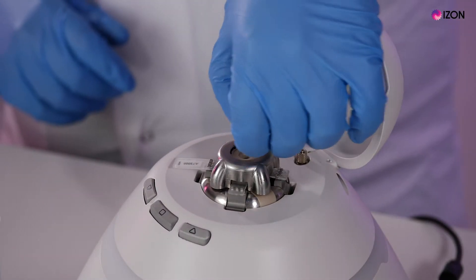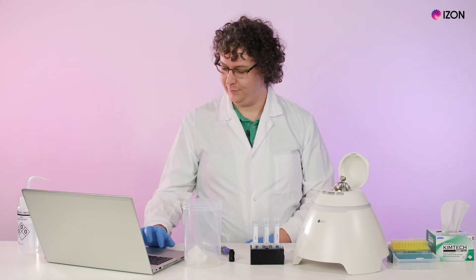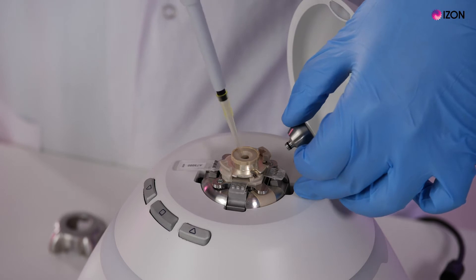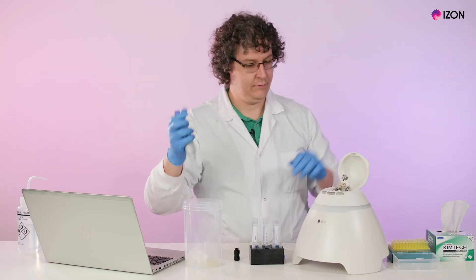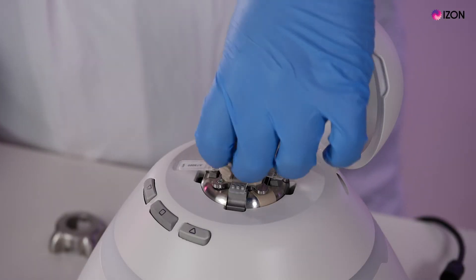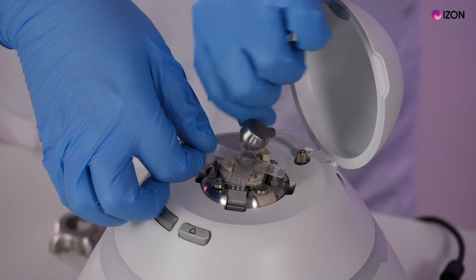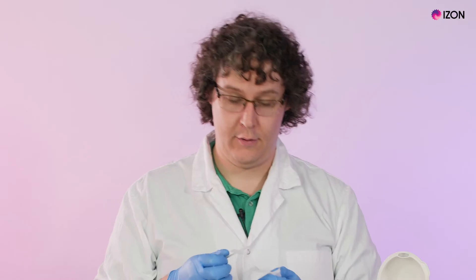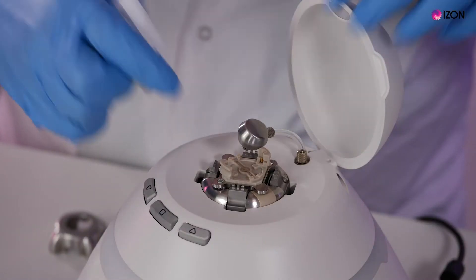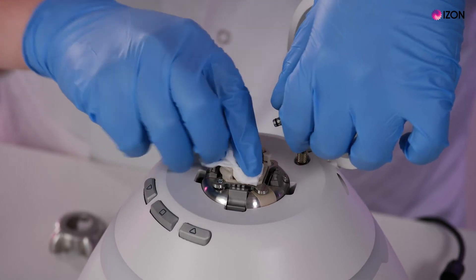Then remove the pressure nozzle and wait for the device to move into the load position. Remove the wetting solution from the upper fluid cell, then remove the upper fluid cell. Remove the nanopore and dry it with a lint-free tissue or a nitrogen gun. Wipe all the residual liquid from the lower fluid cell.